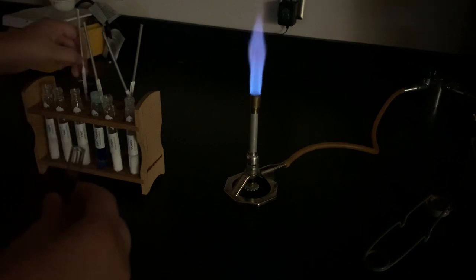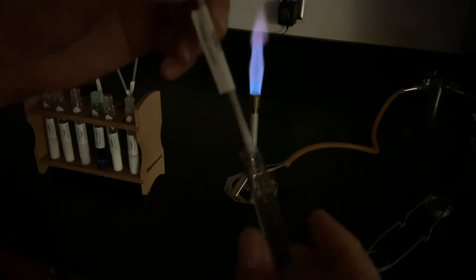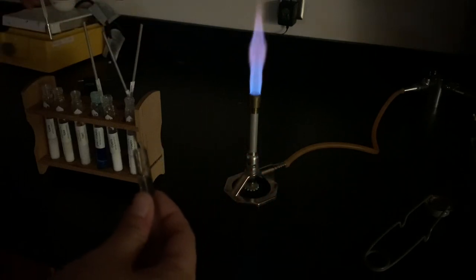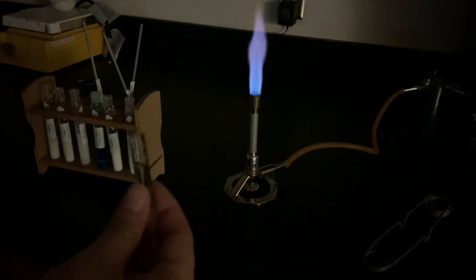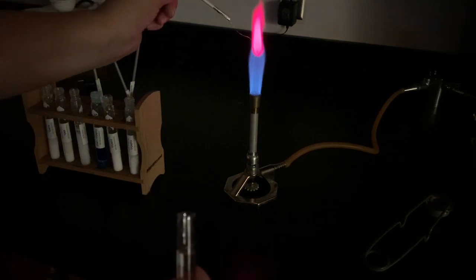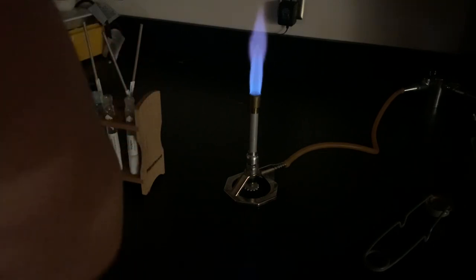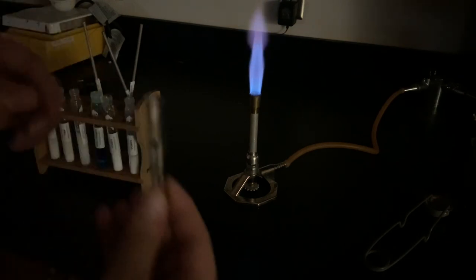The next one is lithium. Again, clean inoculating loop and clean water — I want clean everything. I dip my loop into the clean water and then into my lithium nitrate salt, and hold it in the flame. Lithium is that pretty bright red — a nice solid red color.